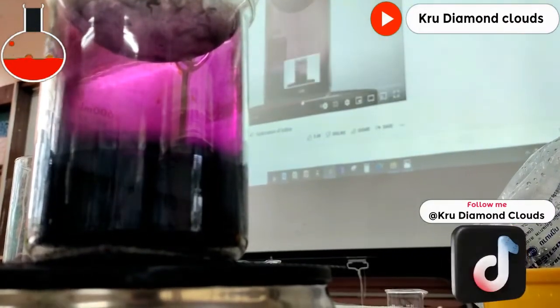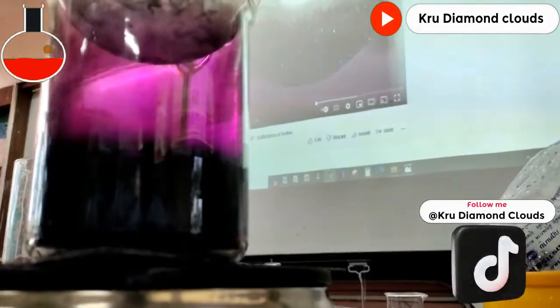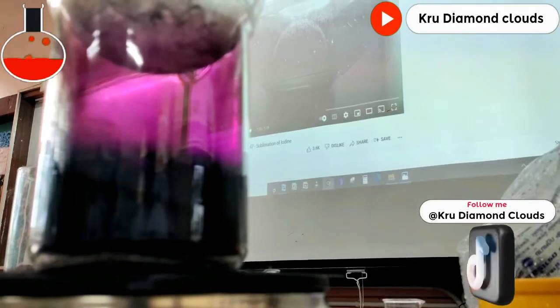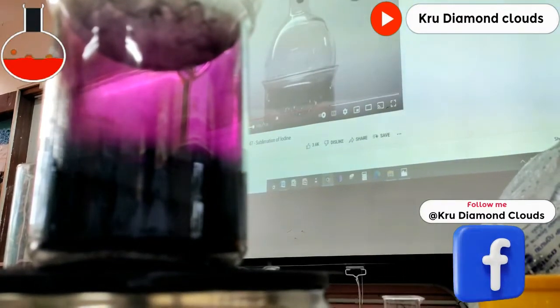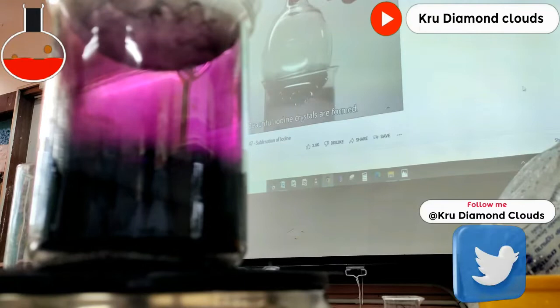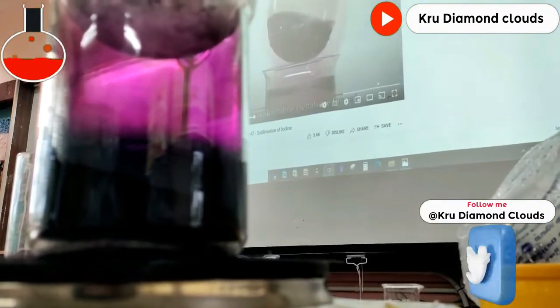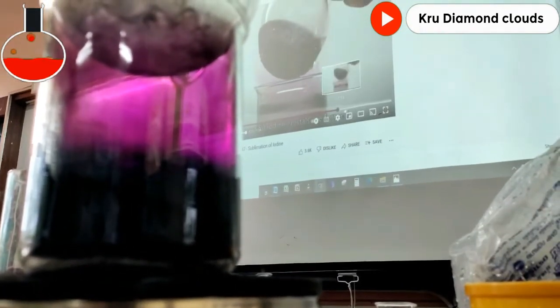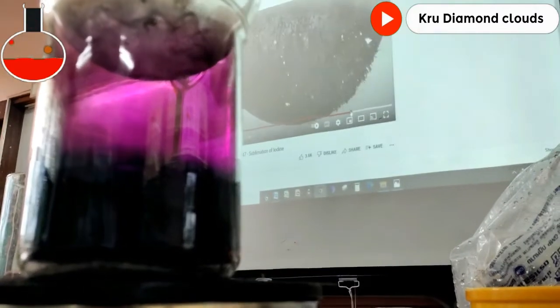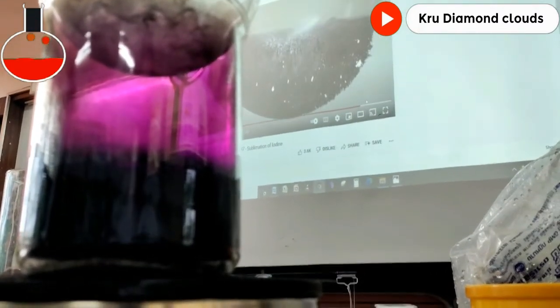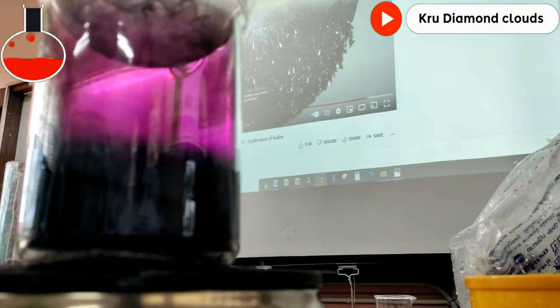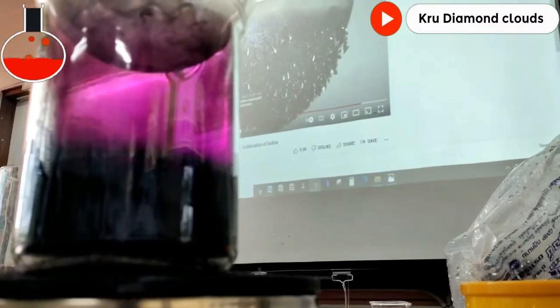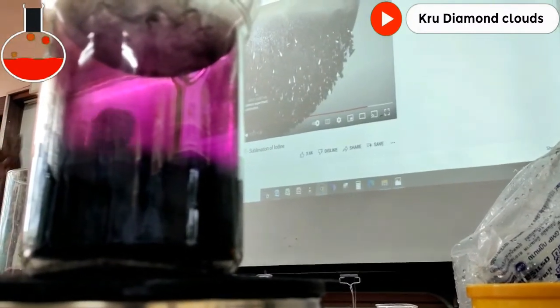As you can see, it's really hot. I'm really cold. It's starting to crystallize. So you see, in this experiment, we did two things.